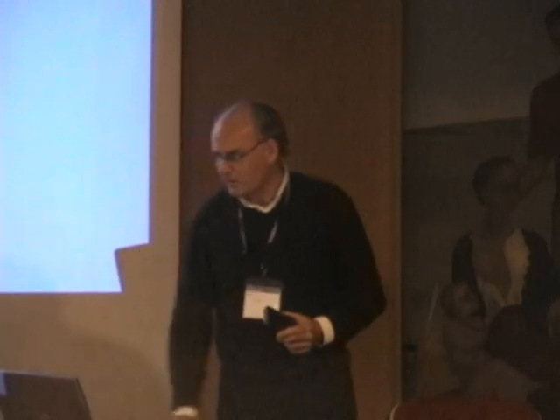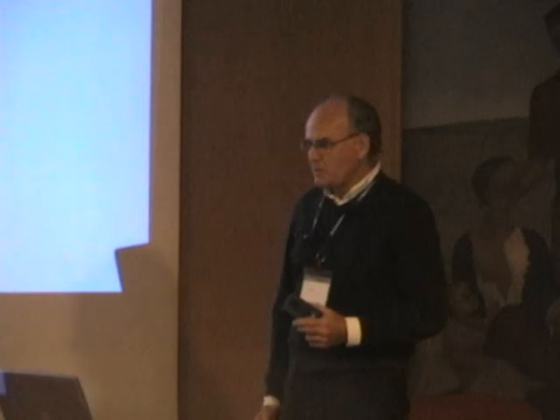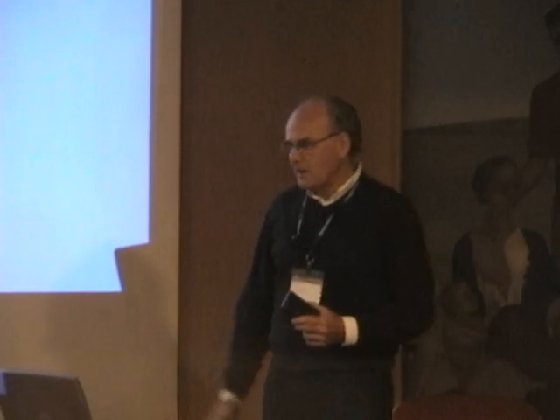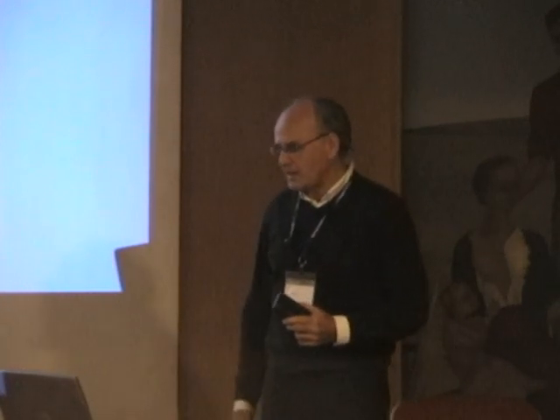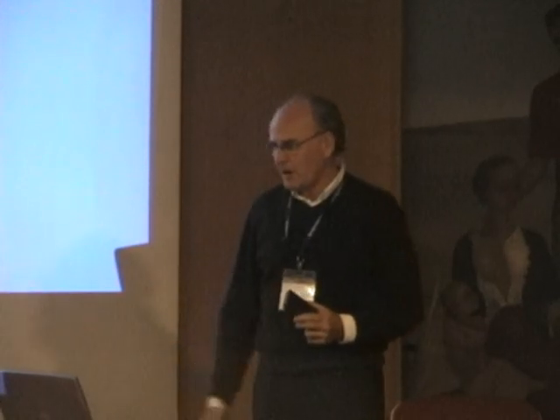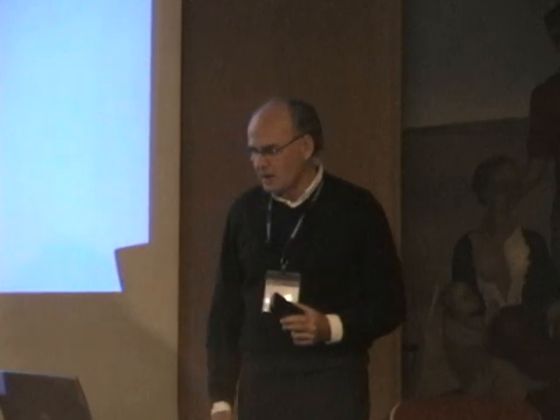So here, just to give you a comparison of what you can see, this is an in vivo spectrum. The upper spectrum is at short echo time, a few milliseconds, the lower spectrum at long echo time, 140 milliseconds, at about 4.7 Tesla. That's what you have to expect from a mouse brain in vivo. You see the number of peaks is not extremely impressive in this spectral region.